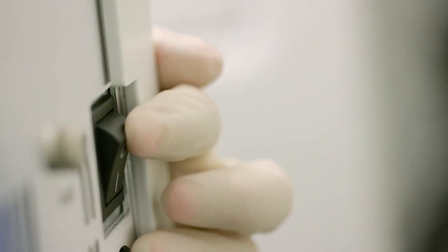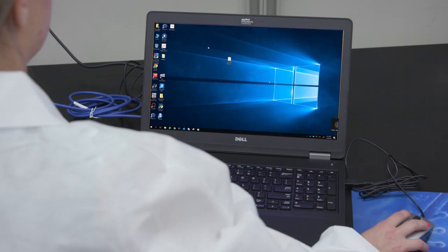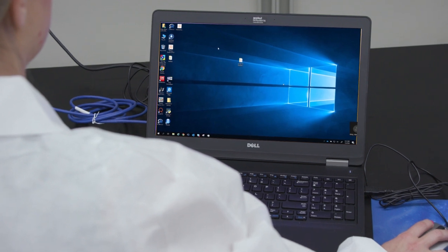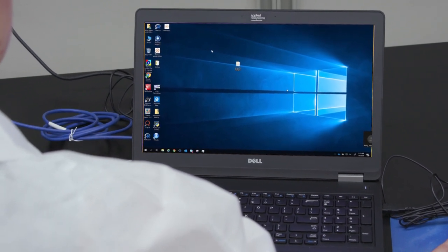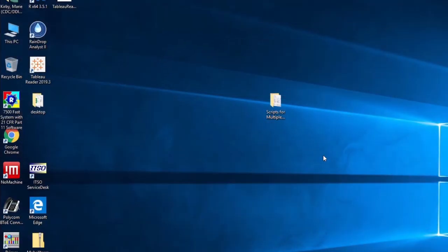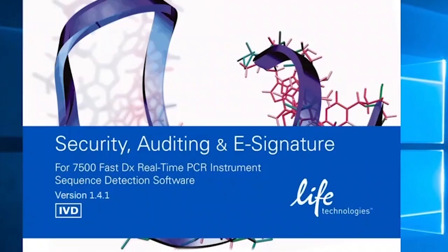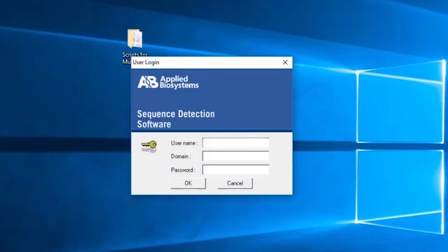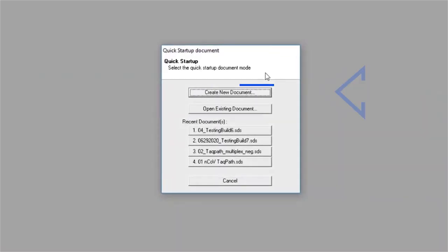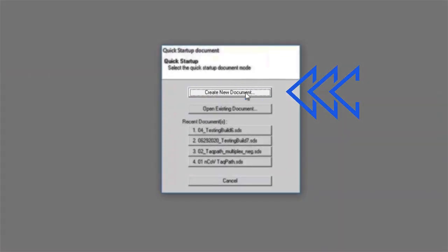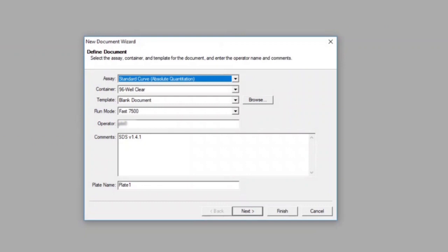First, turn on your instrument and associated computer system and launch the 7500 Fast DX Real-Time PCR System software by double-clicking on the associated icon on the desktop. Once you are logged into the system software, select Create New Document from the menu on the screen. The New Document Wizard screen will appear.